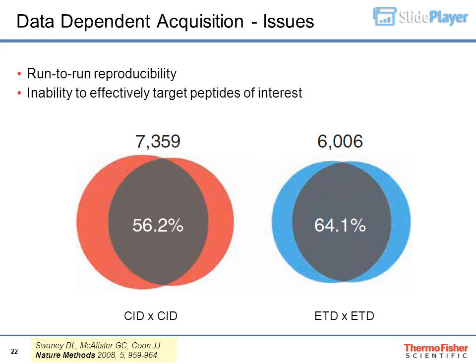Hundreds of peptides often co-elute, so low-level signals are often selected in one run and not the next. Selecting m/z peaks to sequence by abundance certainly does not offer the opportunity to inform the system of pre-selected targets.